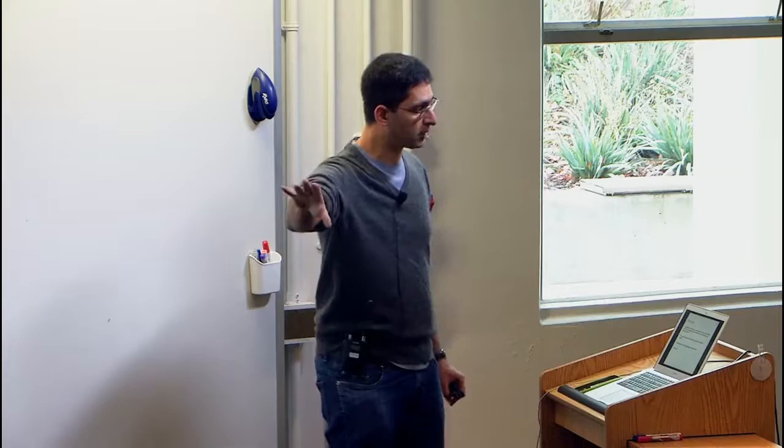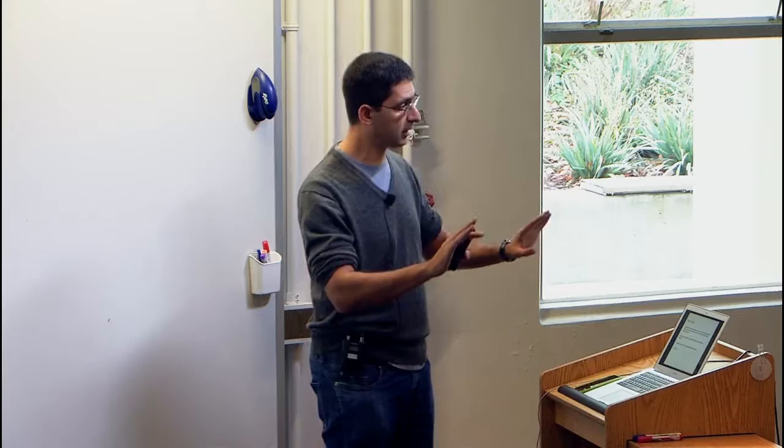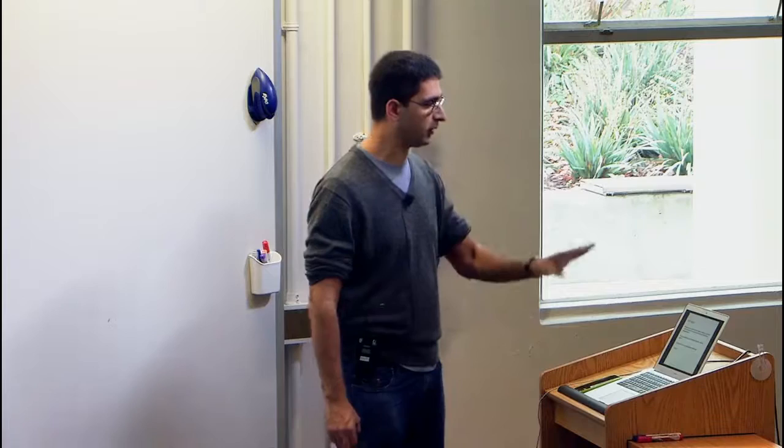Now, occasionally you do have a k-mer that actually is in the graph somewhere else. And then when you take the whole intersection, you get the empty set. There's a number of interesting things you can do. You can go back and try to figure this out more carefully, or you can flag cases like this and put them in a bucket. We've been looking at them a lot, and they're very interesting, because there's usually biology underlying that case. So that's it in a nutshell.